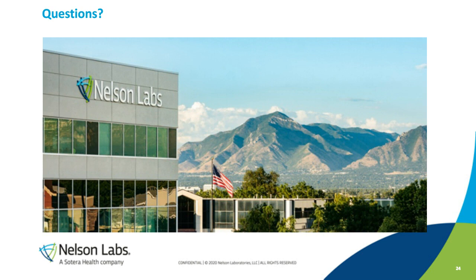Now, cytotox has historically been done that way. Me personally, I actually like, and we're looking at a movement this way, of using chemistry to really help look at this, because what we can do, if you ran chemistry before, we can do a new chemical analysis and really look for residual cleaners, and not even if they're present, but now we actually have an amount instead of cytotox just failing and not knowing, does that mean anything? We can do this tox assessment that Matt's talked about to really understand the impact of that residual cleaner being there. Or we can see if the material's changed sufficiently and now has more toxins or possible compounds that may be toxic leaching due to the cleaning process. So that's not standard. Most people run cytotox, but we do see a push more that way to truly understand the impact of the cleaning and not just have a pass-fail with cytotox.